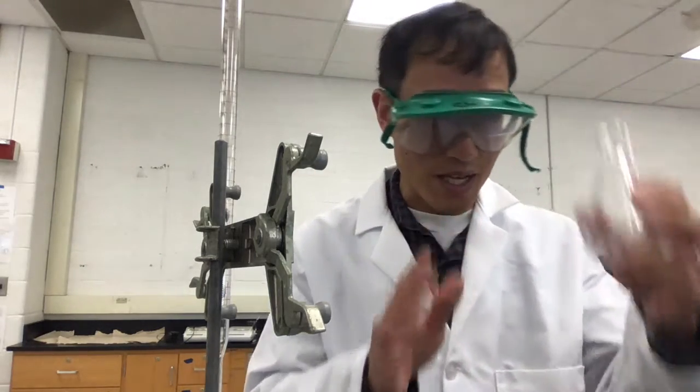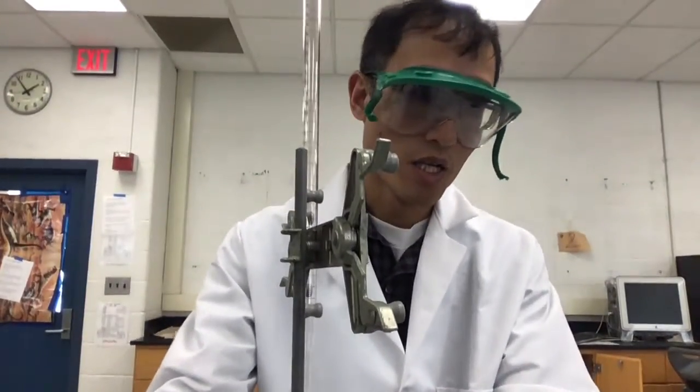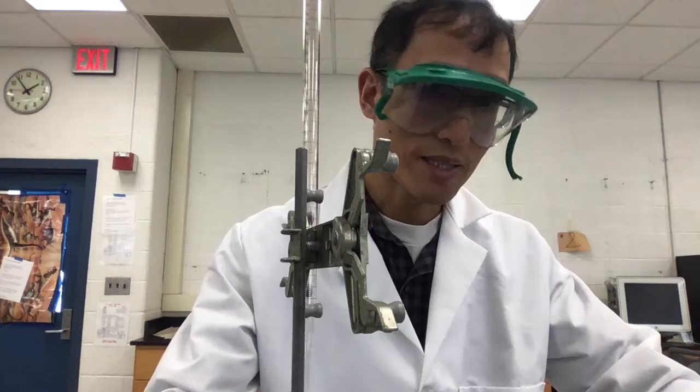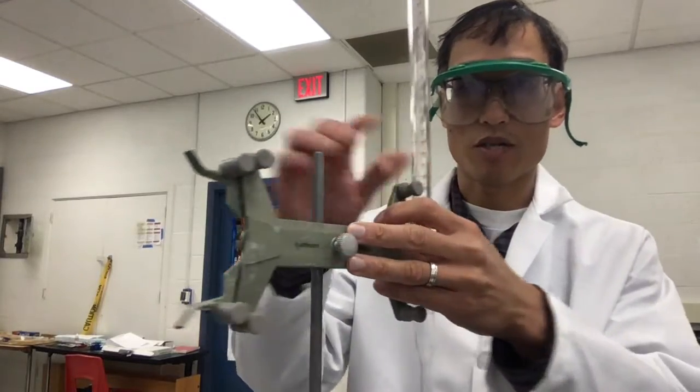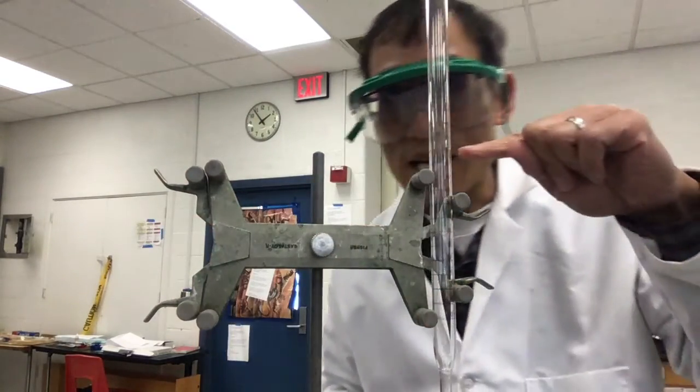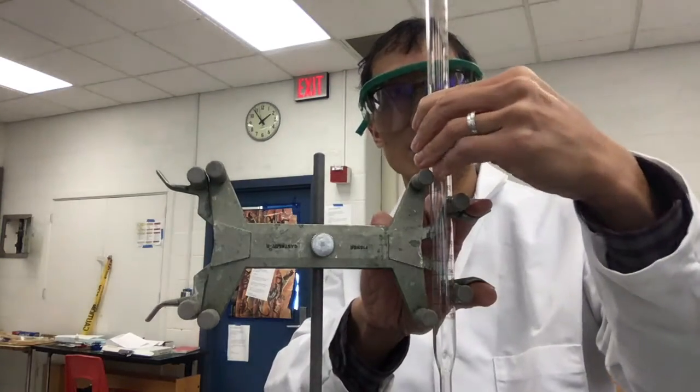So I'm gonna set that aside, and I'm gonna go to the Buret. So this is a Buret. I'll spin this around, you can see it a little bit better. It's got lots of lines on it, so lots of graduations all along the side.